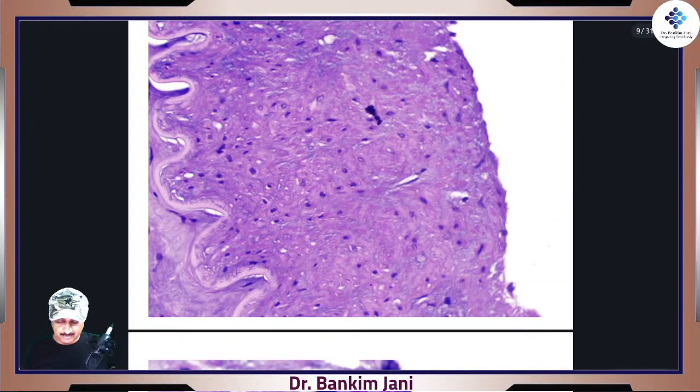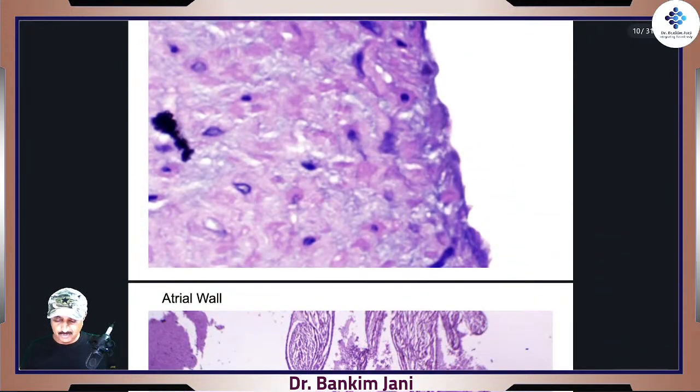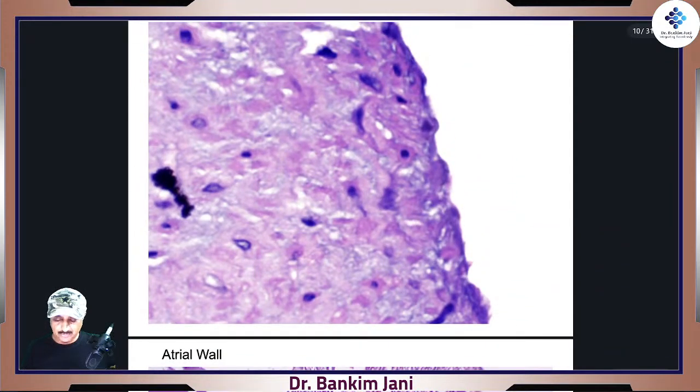Where exactly am I taking you? I'm taking you all the way over here in these areas. Over here, it is the inner one. See, these are definitely flattened. These are flattened cells.